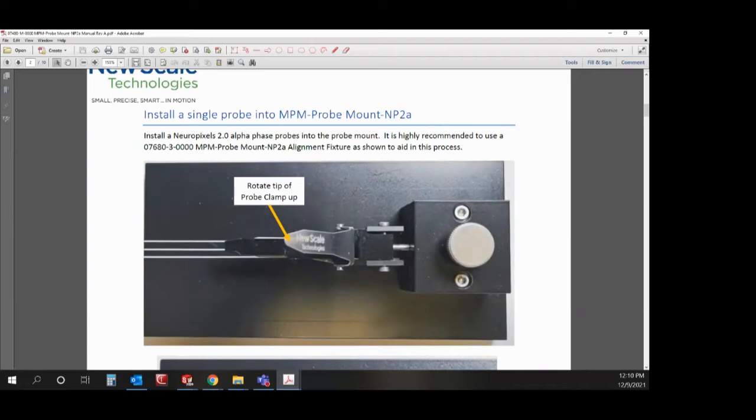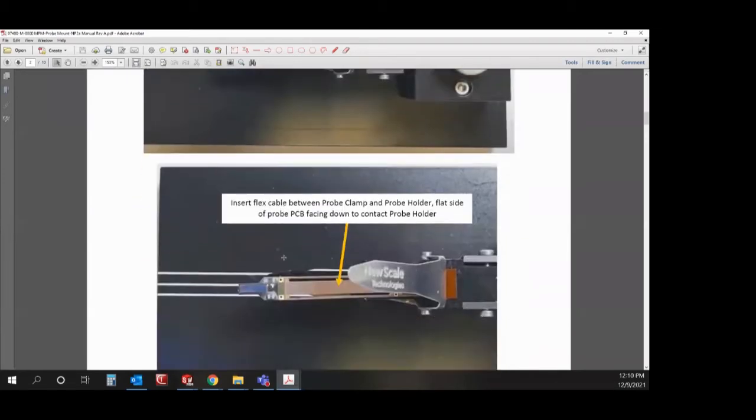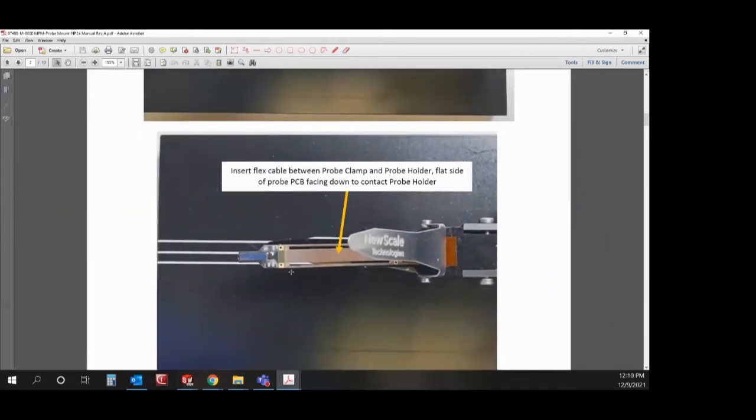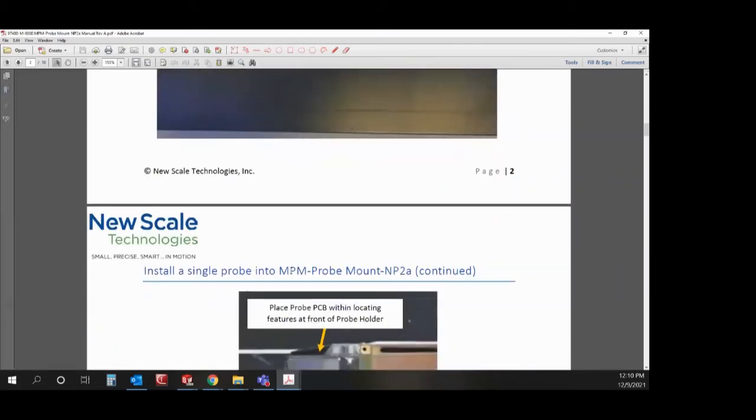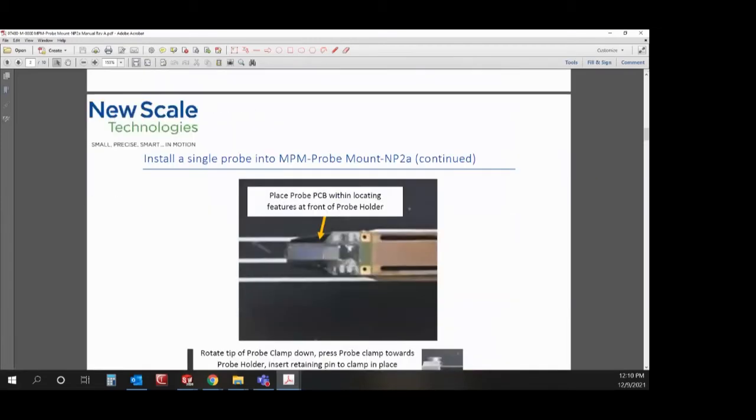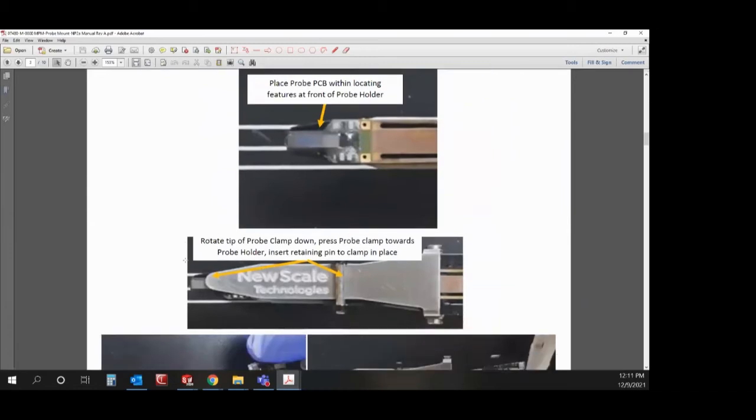So you would rotate the sheet metal clamp upwards, slide the flex cable in between the clamp and the probe body. We have locating features on the front of the probe mount to help keep the probe where it needs to be and straight. Rotate the sheet metal clamp back down, compress it to apply some force and slide the retaining pin back in.